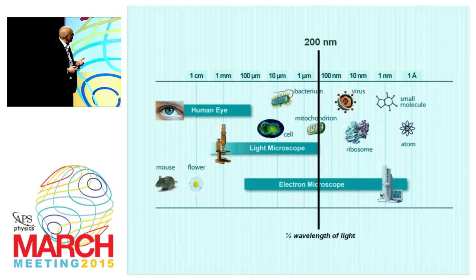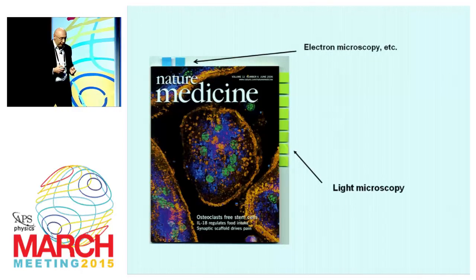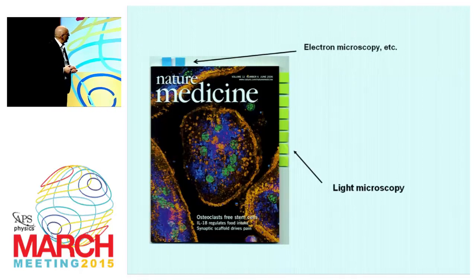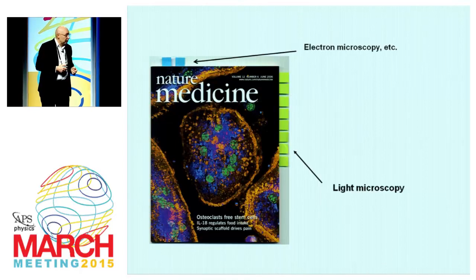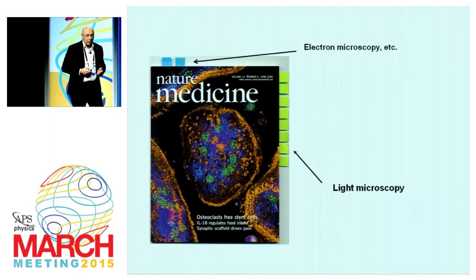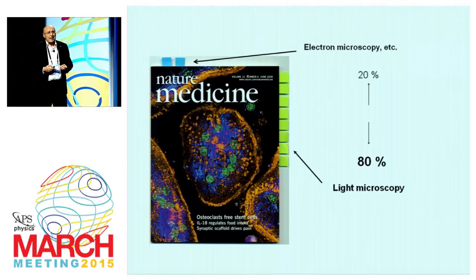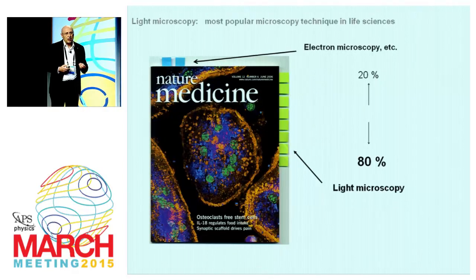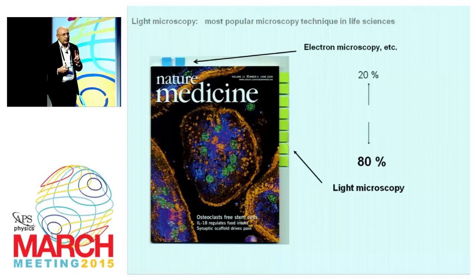I tried to find out how popular the light microscope is. And therefore, I took this basic medicine journal publishing studies in basic advancements in medicine, and I counted the number of studies in which an electron microscope was used and those that used the light microscope. And now you see which of the two won. So light microscopy is still the most popular imaging modality in the basic life sciences. And there are two strong reasons for that.